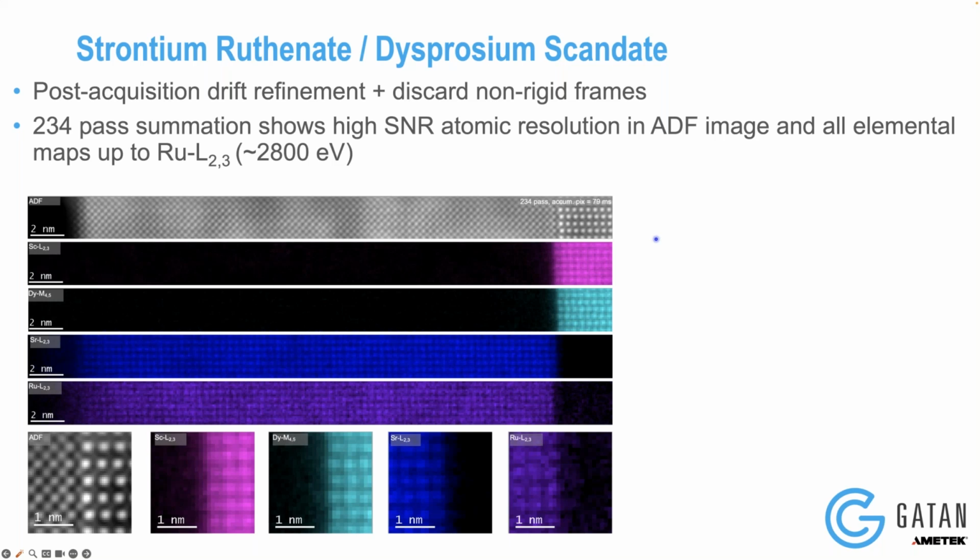The question was about the dose fractionation in the cryo. What the experiment did is acquire the data first, see that the damage had happened, and then go back into the data series and only keep the good frames. So even if you don't know what the damage threshold is, you can throw out the damaged data after the fact. That sets the damage threshold, and you don't have to know ahead of time. Yeah, that's super useful to be able to do.